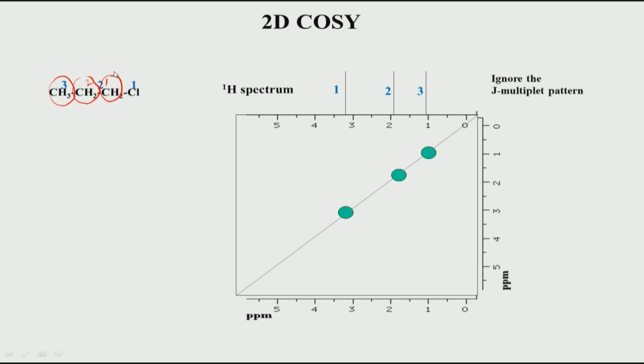That means if I have spin A and B, or 1 and 2 in this case, proton 1 will not transfer all its magnetization to 2, it will keep a lot of it on itself, 80% typically. So, only 10 to 20% will go the other way. The part which does not go anywhere, the 80%, will evolve during t1, that is the vertical axis, omega 1, at the chemical shift of 1, and it will also evolve with the chemical shift of 1 in this axis, because it has not been transferred.